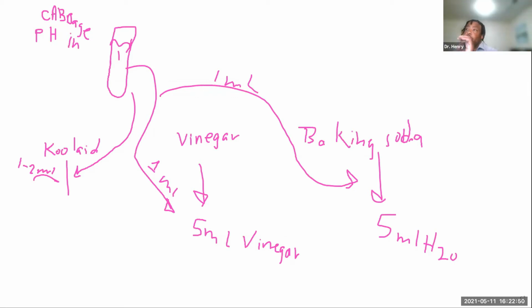Record it, but before you record it, also use the test strips. The test strips should tell you the truth, and I'll give you the indicators for the test strips here. I'm putting that up right now too. In my Kool-Aid, it didn't do anything because I have a red Kool-Aid. So yeah, there's something wrong with it. Just make note that there's something wrong.